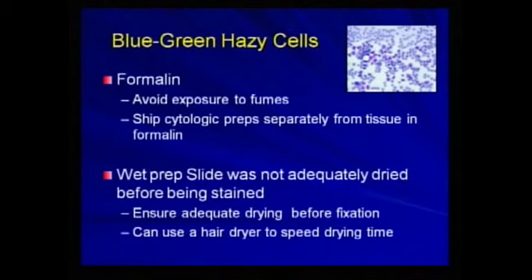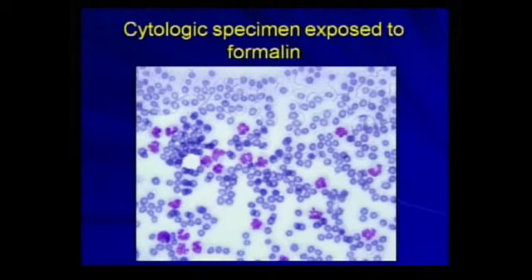Okay. Another way that you can ruin a good smear is not to dry the preparation before you start to stain it. Make sure that your smears are adequately dried. You can put them on a drying rack, or you could even use a hair dryer on low setting if you're really in a hurry. Okay, but you can't properly stain a wet smear.